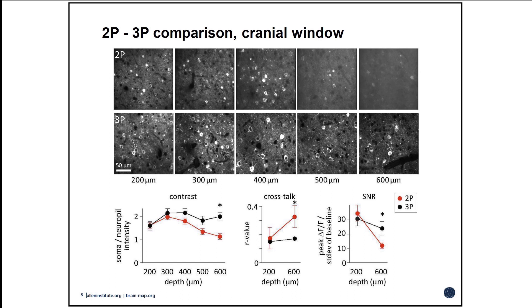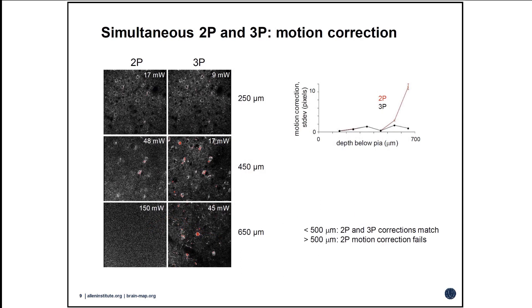What we end up with is an image pair where the two images are separated by only a millisecond — the time of a line. In the superficial locations the movies look nearly identical, but as you go deeper you get nice three-photon movies where you can see cells and activity, while in the two-photon image you're really lost. We found that this loss of contrast compromises our ability to motion-correct the movies and to segment the cells.